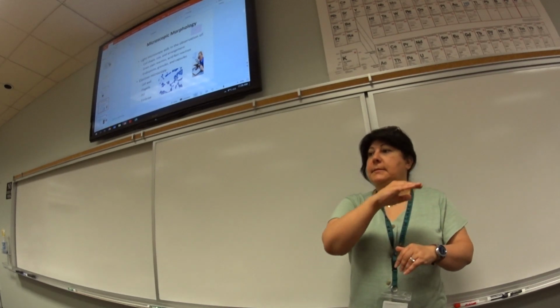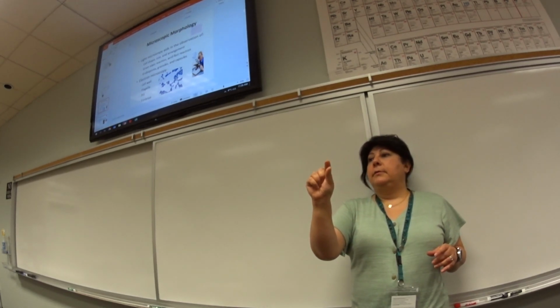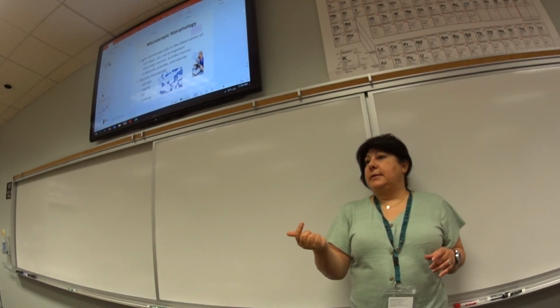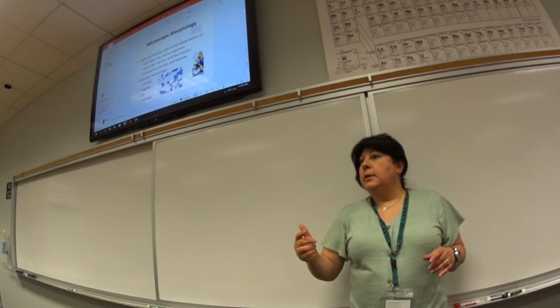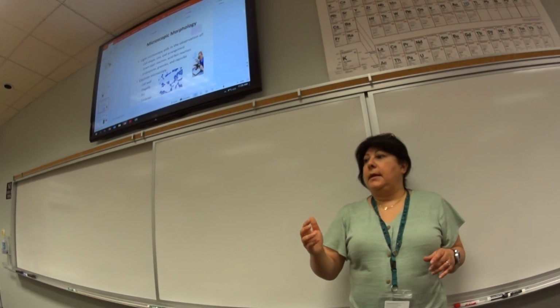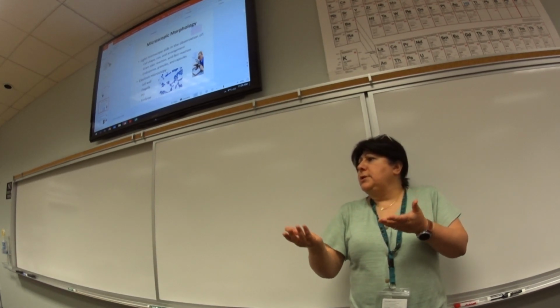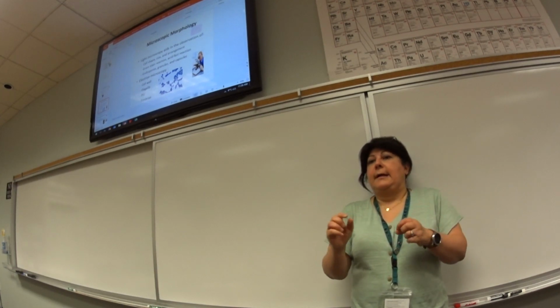Great, purpose. Then, write down unknown number 5, physical characteristics. Received a slant. The slant has a lot of growth. The slant's coloring has a golden hue. Pseudomonas aeruginosa, some pigmentation has been there, things like that.